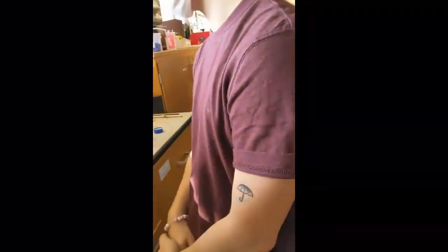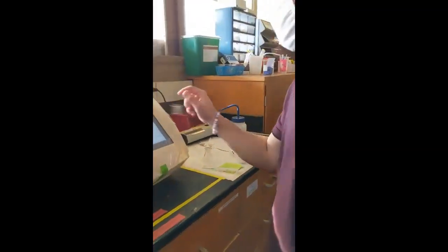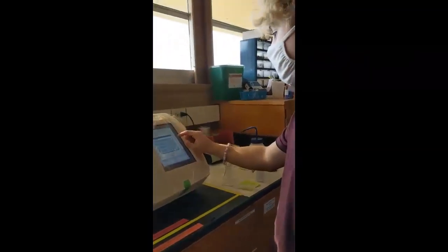You're going to click on the specific rotation. You can click on the regular rotation, but then you'd have to do the math yourself. And if it will do the math for you, why would you want to do it yourself? Because your sample is a solution, you click solution.